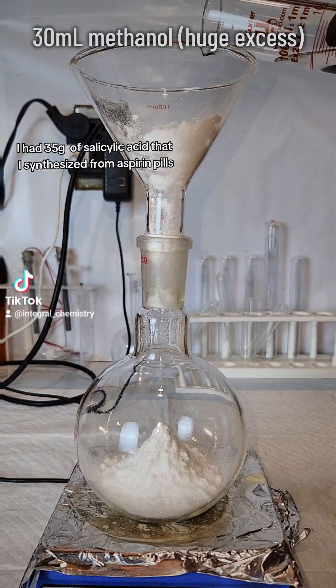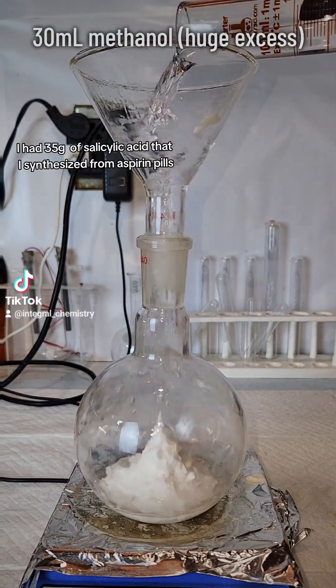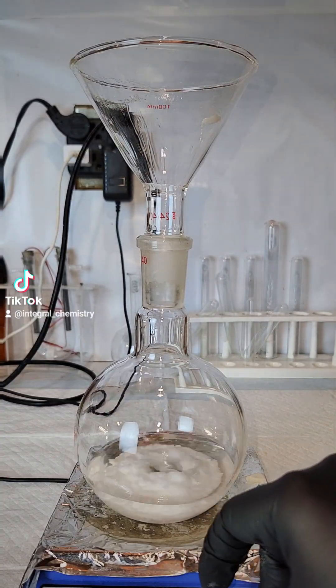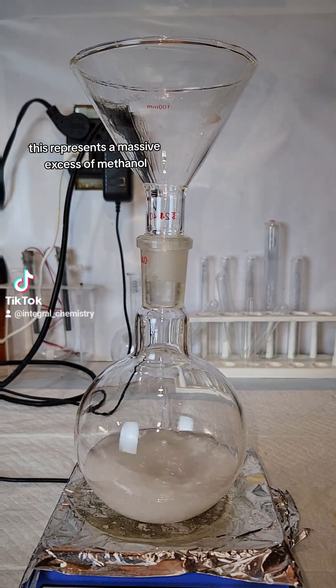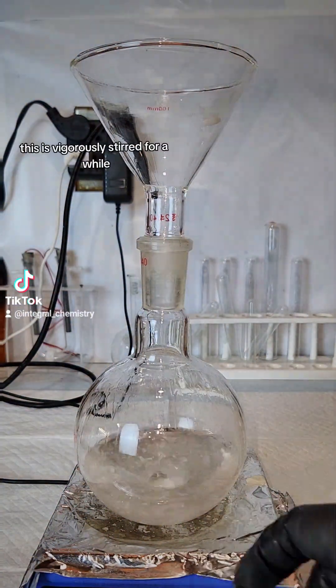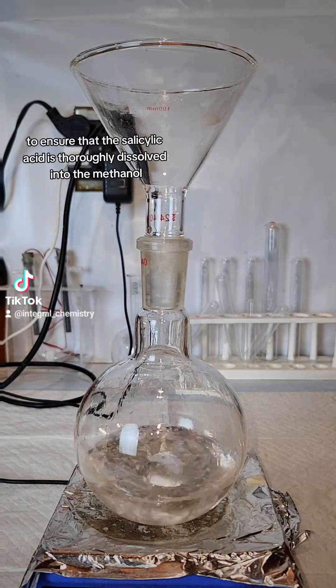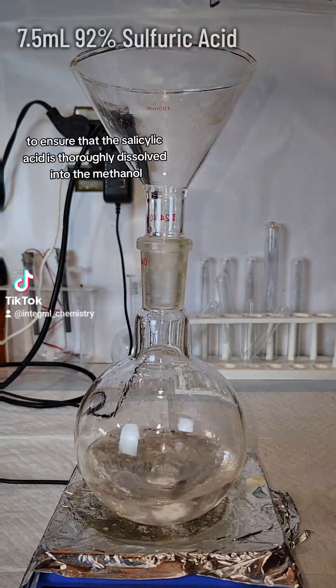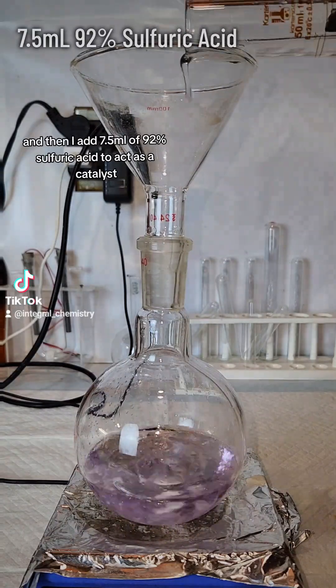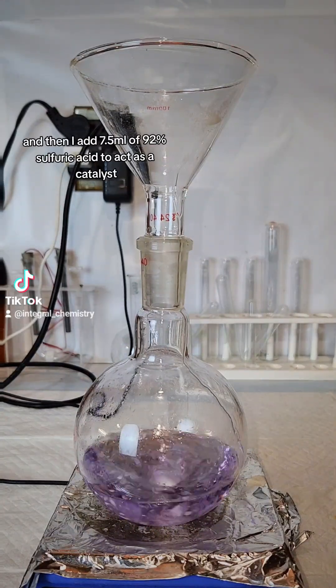I add 35 grams of salicylic acid that I synthesized from aspirin pills along with 30 milliliters of methanol to a flask. This represents a massive excess of methanol, which makes salicylic acid my limiting reagent. This is vigorously stirred for a while to ensure that the salicylic acid is thoroughly dissolved into the methanol, and then I add 7.5 milliliters of 92% sulfuric acid to act as a catalyst.